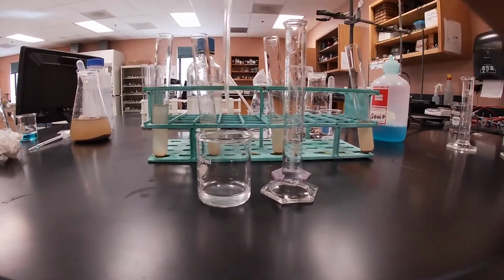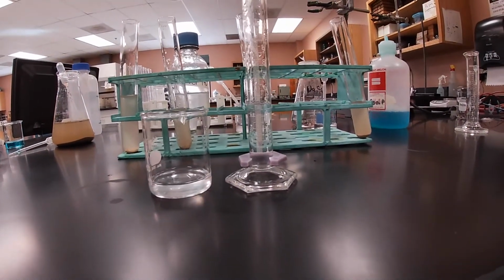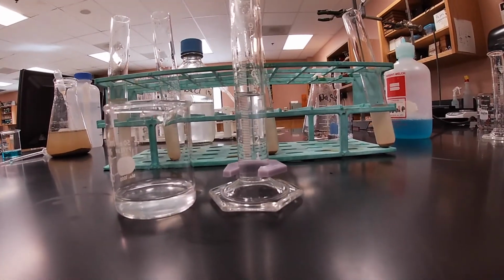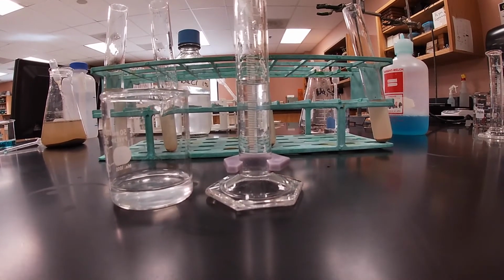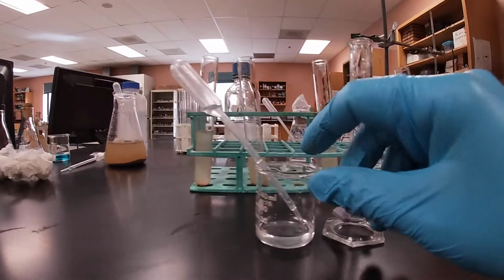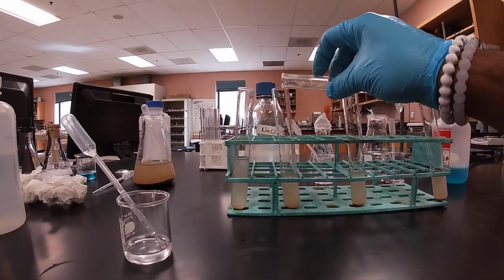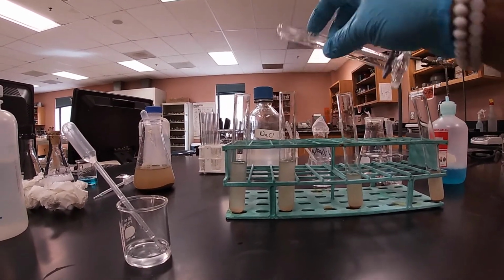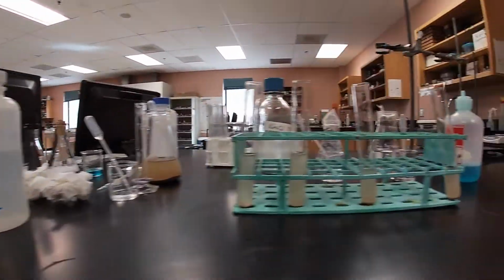And then I'll shake them all up right now, and we're gonna have to wait about 15 minutes. I think we're about good right there. No, maybe a little bit more. All right, and so we're gonna put our sodium chloride in our test tube right here. That's 5 milliliters. We'll set this one aside. Just remember what that is.